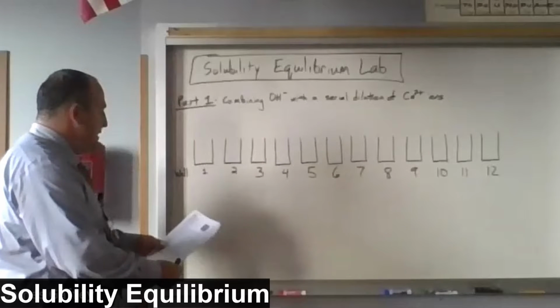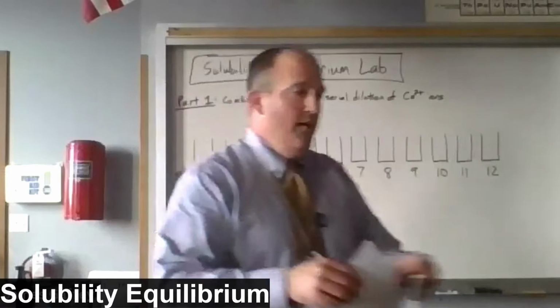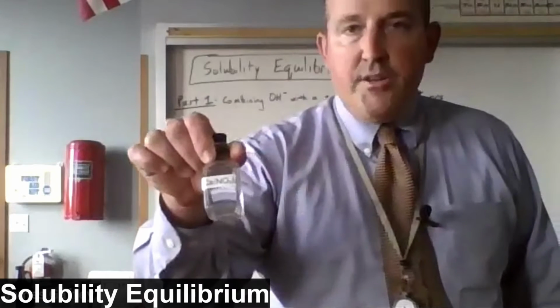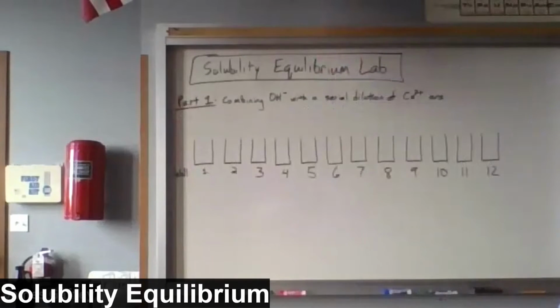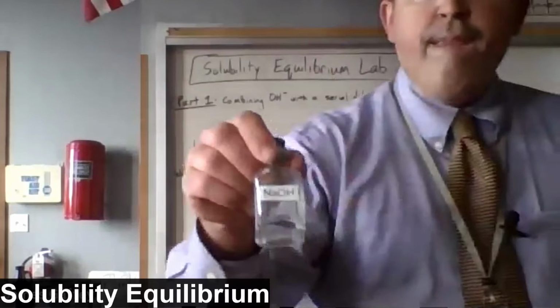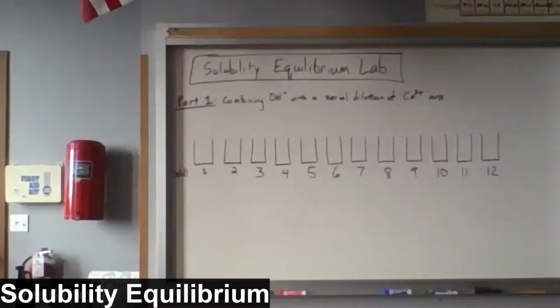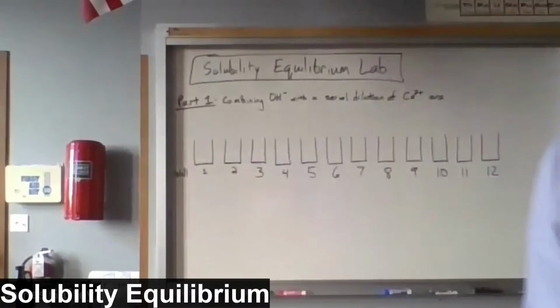In doing this, we're going to take 0.1 molar solutions of calcium nitrate, which delivers the calcium ion, sodium hydroxide, which delivers the hydroxide ion, and when called for, we'll add water.